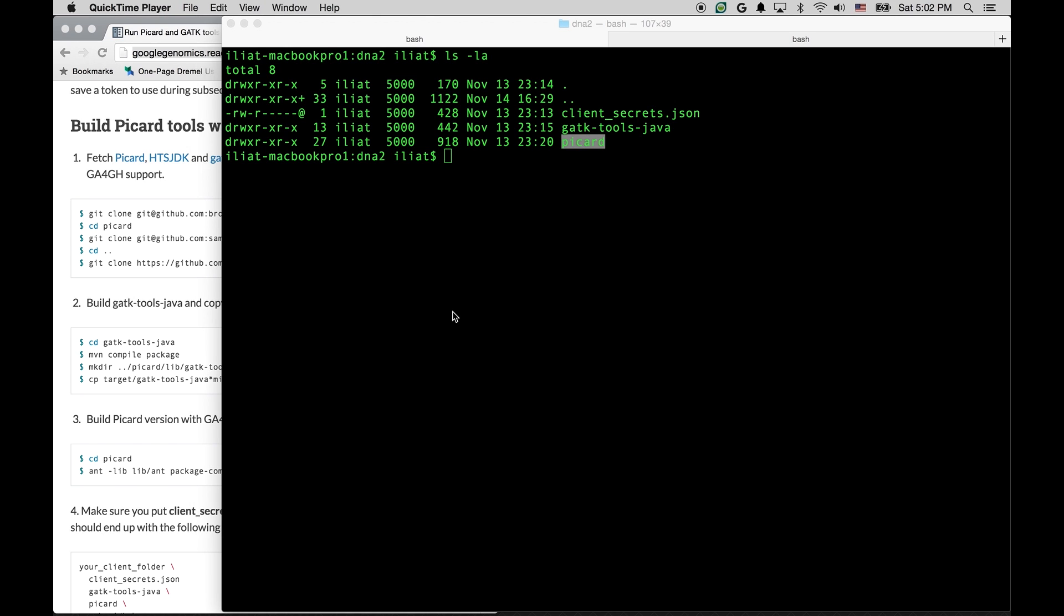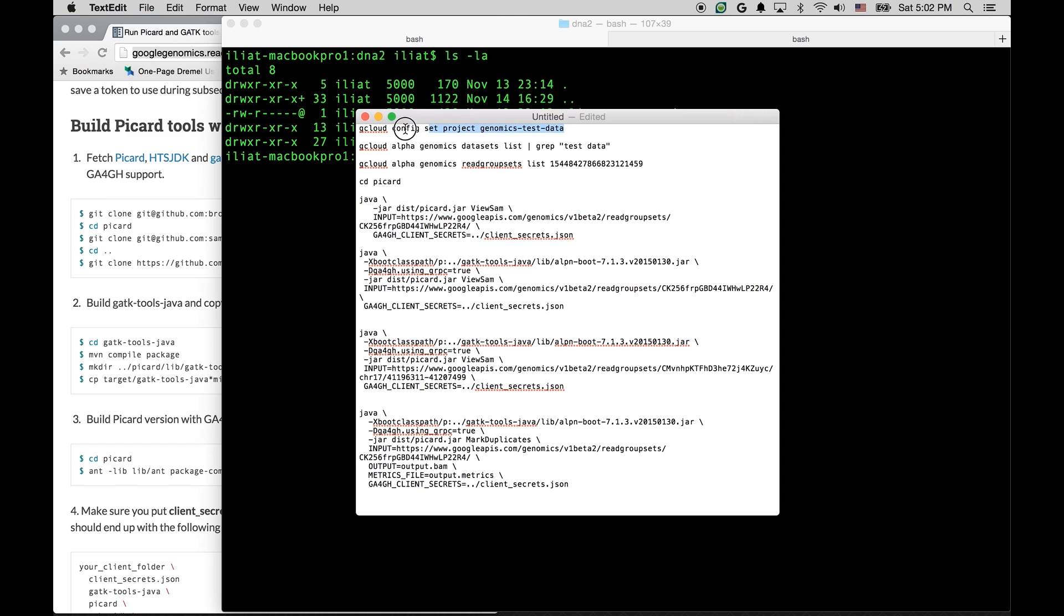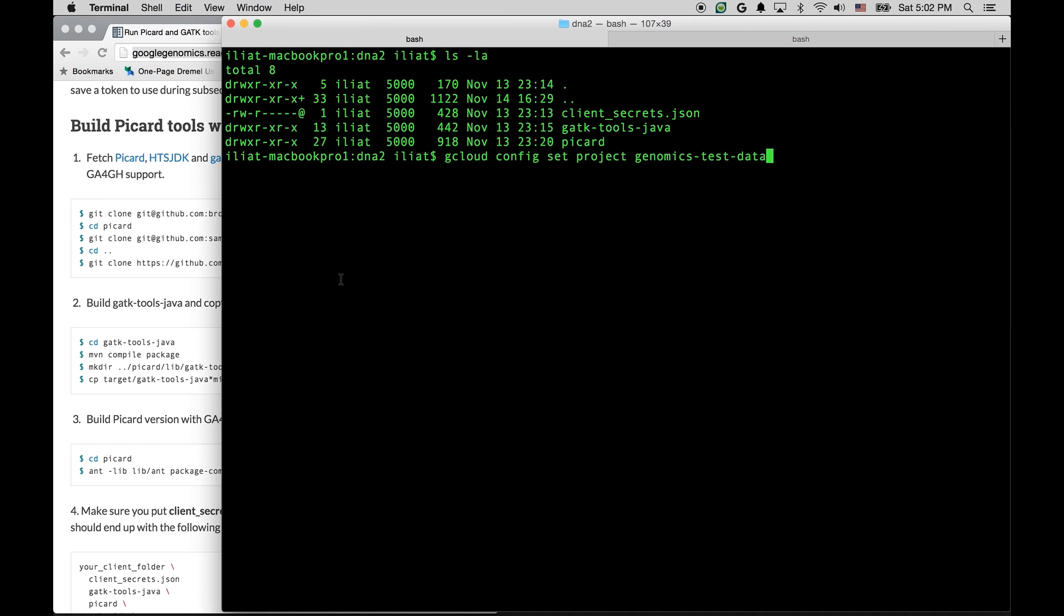Now, let's see if we can run a basic ViewSAM tool and have it output data from the cloud. First of all, let's tell the API which project we will be working with. We're using GCloud tool to tell the API that we are going to be working with project called Genomics Test Data.